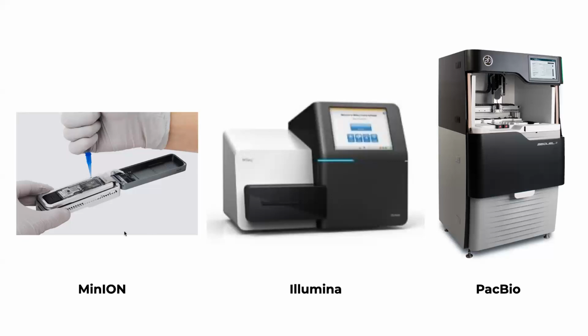So when we think about different challenges involved in metagenomic sequencing, all of these tools are going to be very useful. Whenever you're looking for data on NCBI, for example, or in a public domain repository, always ask the question: how was it sequenced? That will give you some idea of what kind of information you can actually extract from the sample.